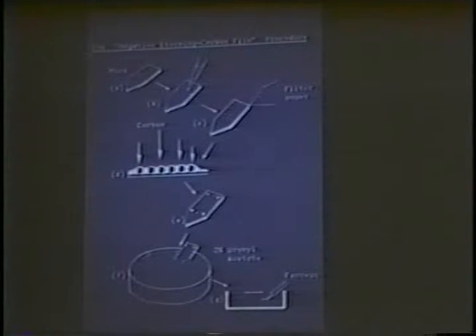Protein or enzyme solution at a concentration of approximately 1 milligram per ml, and ideally in a low ionic strength buffer, is mixed with an equal volume of 2% ammonium molybdate, usually at pH 7.0. This solution is spread evenly on the clean hydrophilic surface of small pieces of freshly cleaved mica. The excess fluid is drained off onto a filter paper, and the remaining fluid is allowed to dry at room temperature.